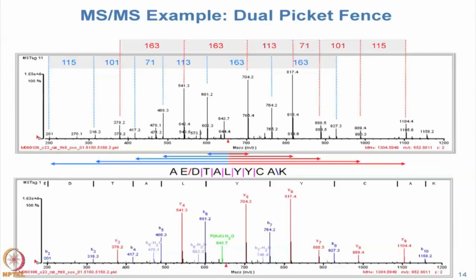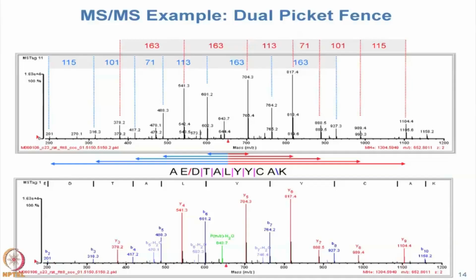This is the way a spectrum comes out of the instrument. There's no red, there's no blue. It's just a bar chart, black numbers on it, and you have to interpret it. By the way, this one is a beautiful spectrum. Life would be grand if everything was like that. The pickets represent the peaks, and the spacing is nice and desirable, and it would be ideal. If you had the choice to have a very nice looking spectrum, it would look like this.